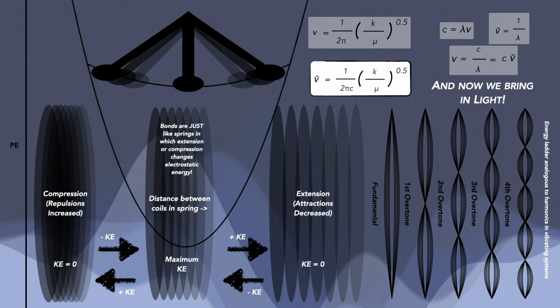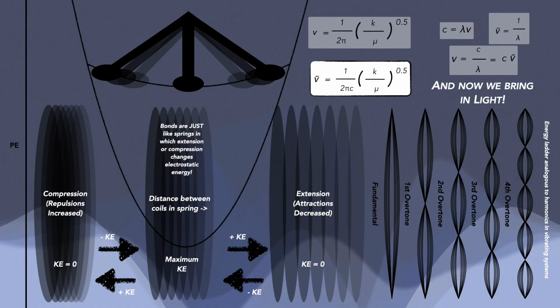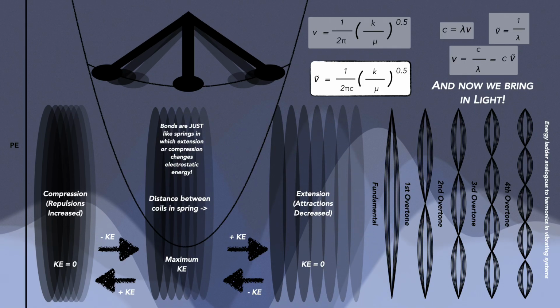The vibration still exists, it just cannot absorb IR radiation. And so that's why we will focus here on bonds like oxygen single bonded to hydrogen, or nitrogen single bonded to hydrogen, or even carbon double bonded to oxygen, where they give very strong IR signals.